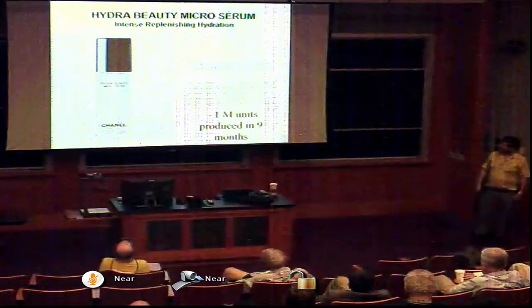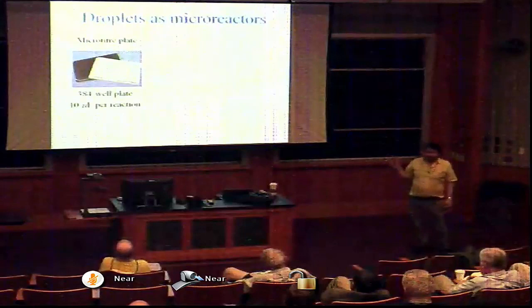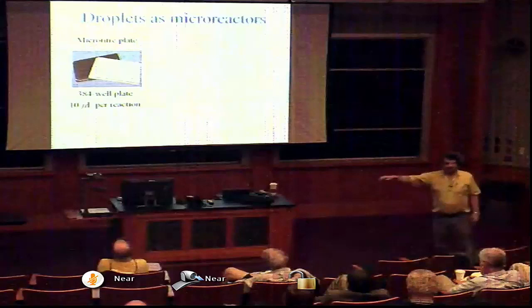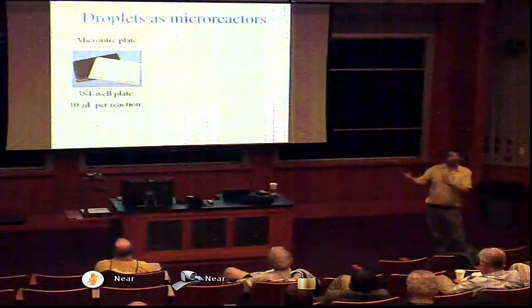Okay, I'm going to spend about 2 or 3 minutes more just telling you the other half of what you can do with microfluidics. Again, emphasizing drops. And that's the lab on a chip side. Let me show you why this is interesting. If you want to do a lot of experiments these days, and in biology you often want to do a lot of experiments, you get a machine that has a robot with a bunch of pipettes, and you use what's called a microtiter plate. You use this plate. This has 384 wells. Each of these wells typically has between 10 and 100 microliters inside. And in each of these wells, you do chemical reactions.